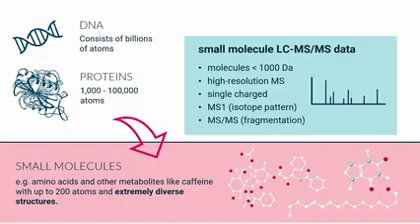So I will start with a brief introduction about the background and what all the tools do. At first I want to give you a short overview of what SIRIUS is meant for. What kind of data do you need to use SIRIUS? It's all about identifying small molecules, so molecules that have less than 200 atoms or less than 1,000 Dalton. You need high-res data. We only annotate single-charged features, and ideally you would have an MS1 isotope pattern, and also, that's the most important part, an information-rich fragment spectrum.